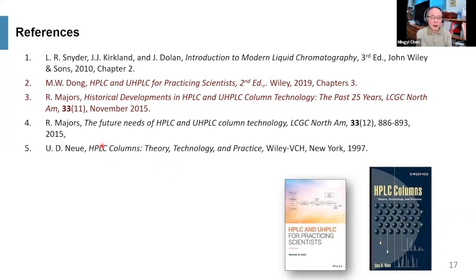Here's the book by Uwe Neue, who was the director at Waters for about 3 decades, right? Uwe Neue, as I mentioned, was a German chemical engineer. He passed away about a decade ago, and he wrote a book which is still a classic HPLC column book, published in 1997.